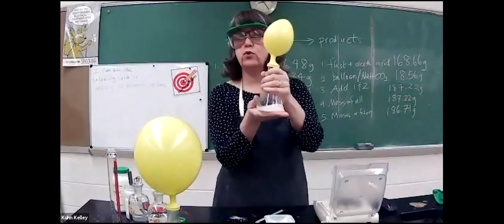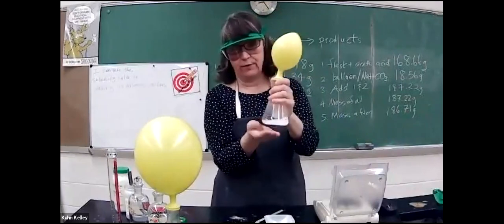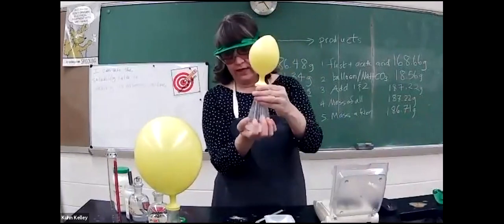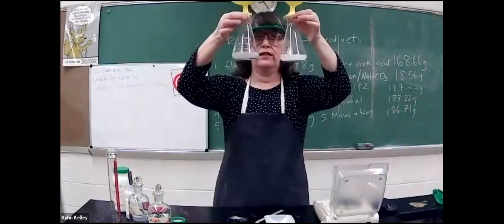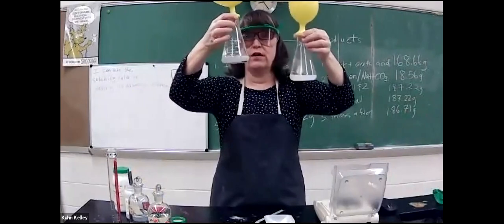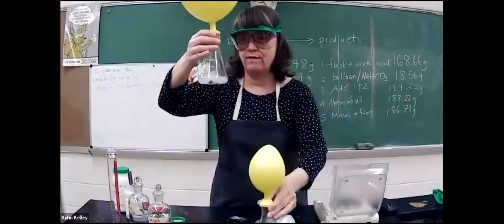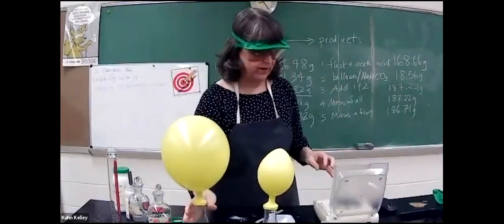This feels cooler than it did to begin with. It actually feels a little cold now as opposed to room temperature. And you can see the reaction went much more quickly. This one does not have any condensation inside. This one has quite a bit. So I know that some of the water in this situation converted to water vapor.